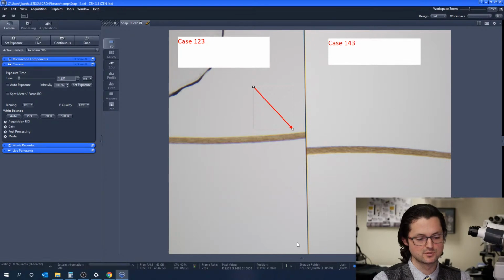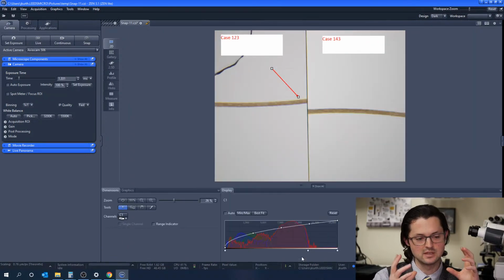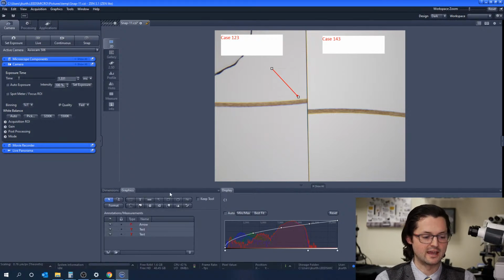There are some other ways to do it too. There's this little, you can barely see it, but there's this little up arrow at the bottom. If you click it, it'll shrink down the image you're working on and bring up this cool little toolbar below. You can click Graphics, and then you're going to have graphic settings that you commonly use, like text boxes, info stamps, things like that. More on this in a second.